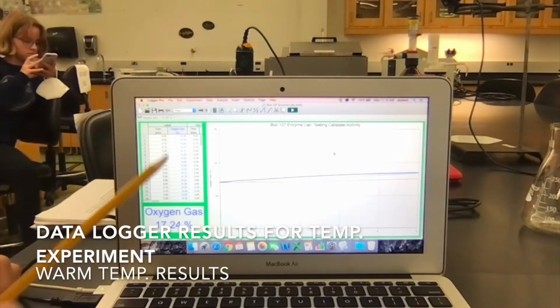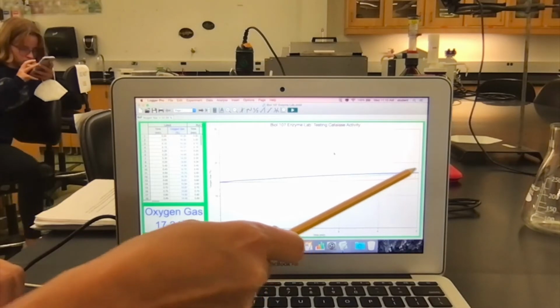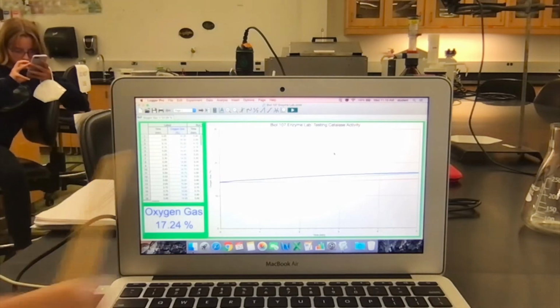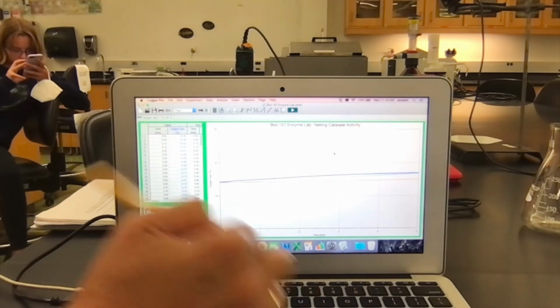Okay, now you can see this blue line. That was the warm bath, which was 45 degrees, now it's about 40 degrees. So you almost see it went up. It went up a lot higher than room temperature, definitely higher than the cold one.